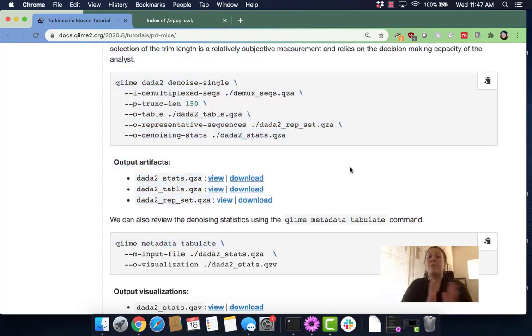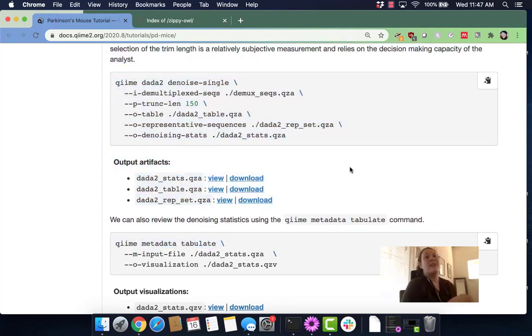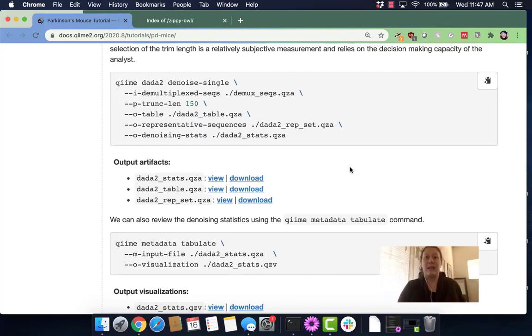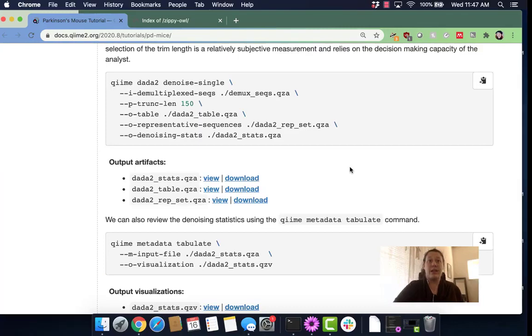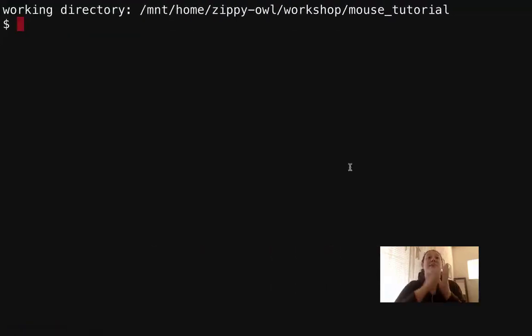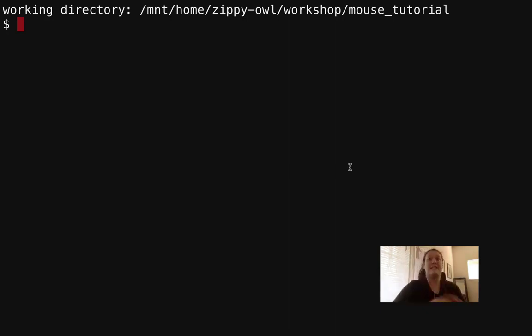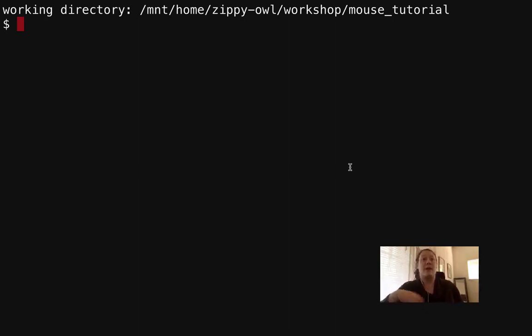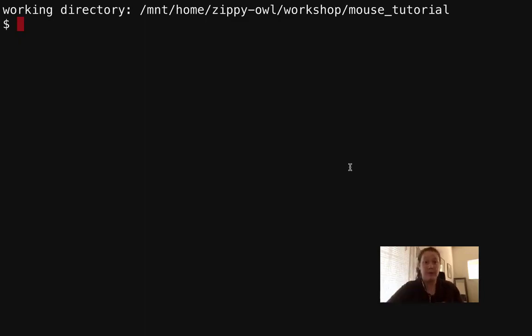Before we get on with the fun of this tutorial, let's talk about where we came from, what our last tutorial was. In our last tutorial we had imported the QIIME 2 data, and at the very end we were looking at the demux-seqs.qzv file and talking about what it showed us.